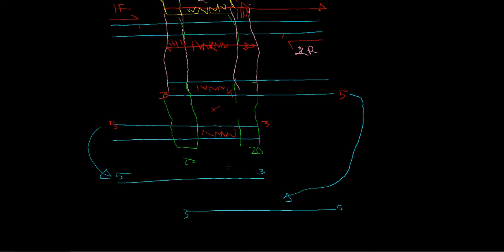So now we start to see why we had that other region of homology. So on this chunk, on this piece of DNA, our oligo bound to this region in order to generate this chunk.